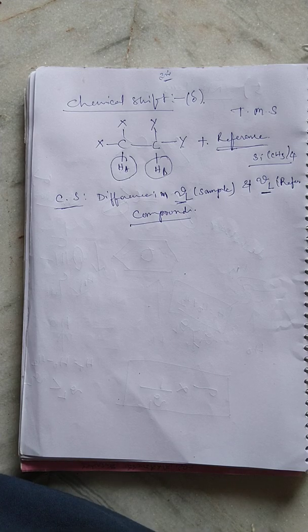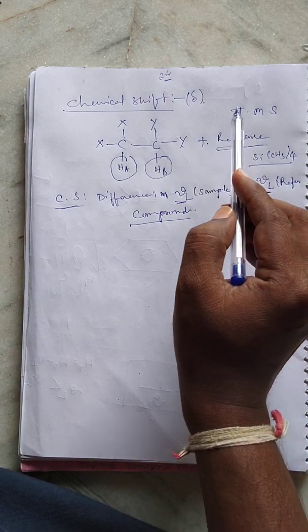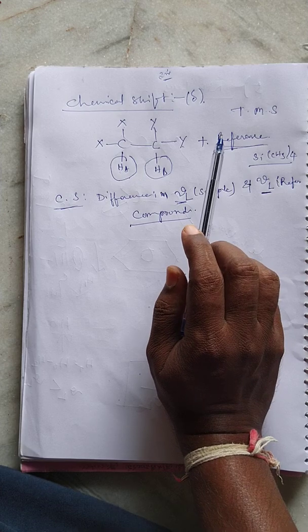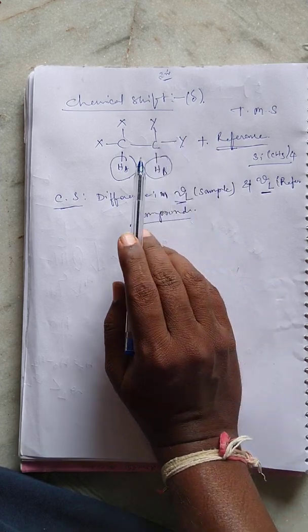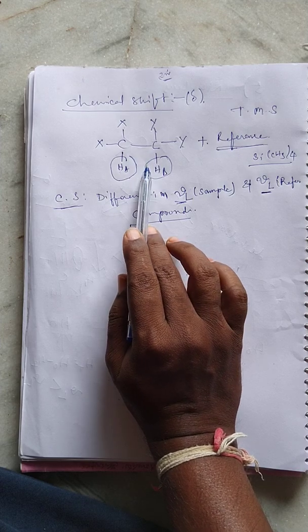So for example, let us discuss, if we subject all these things, the reference and the sample, to proton NMR.